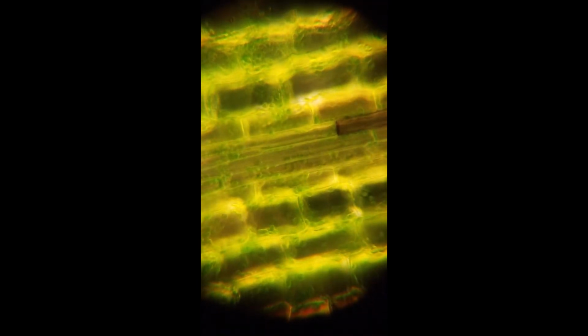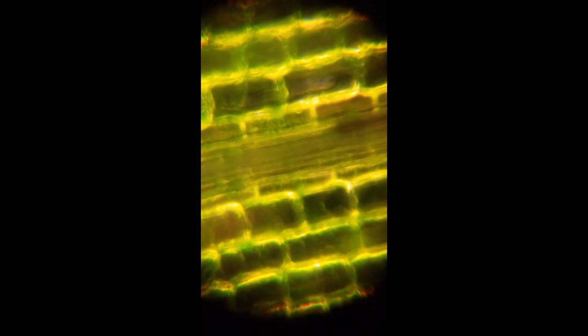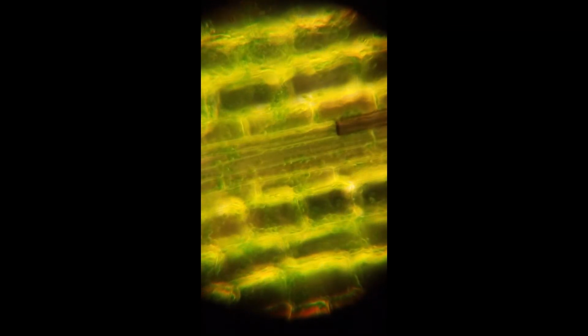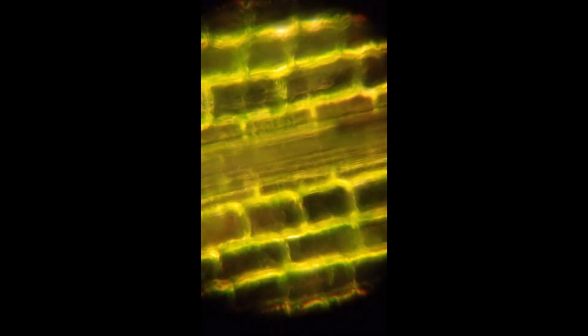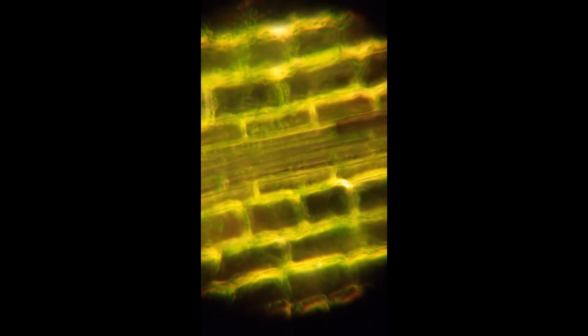I like this shot the most. I'm going to turn up the light source. So by using Darkfield on this leaf, I've made, without meaning to, a little lava lamp of chloroplasts.